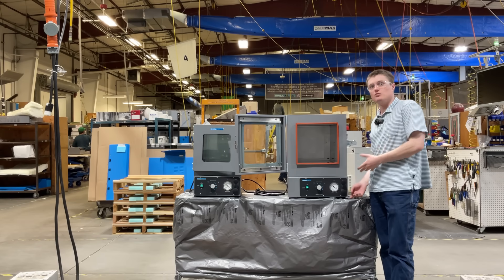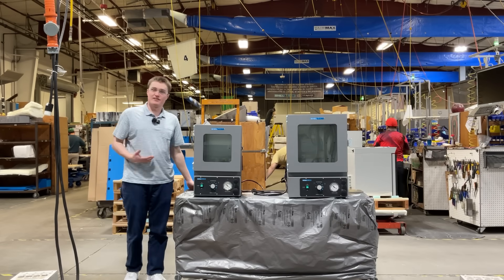Below, you will see the control panel, which we'll discuss more in a moment. Now, let's take a look at the back of the unit.